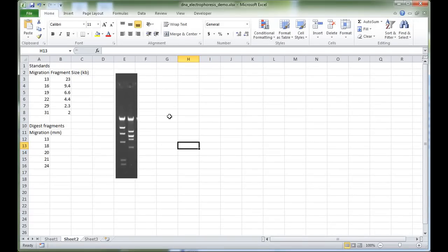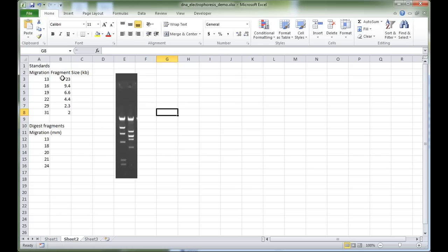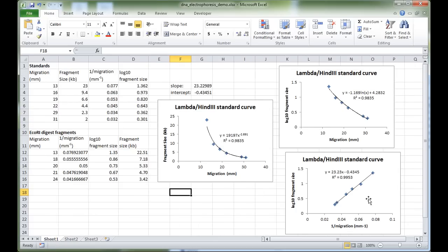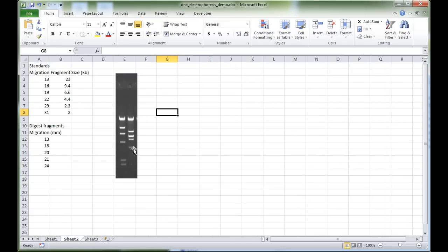In this video I want to show you how to use Excel to process and analyze information for your DNA electrophoresis experiment. We want to take this gel picture of a particular digest and using the measurements of migration for these bands — for the lambda HindIII standard and for one of your unknown enzyme digests — make standard curves to relate a known quantity to an unknown quantity, and use that to work out the actual sizes in base pairs and kilobase pairs of unknown bands.